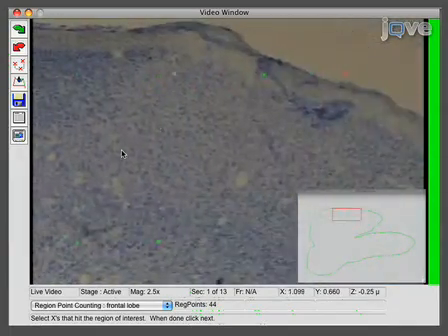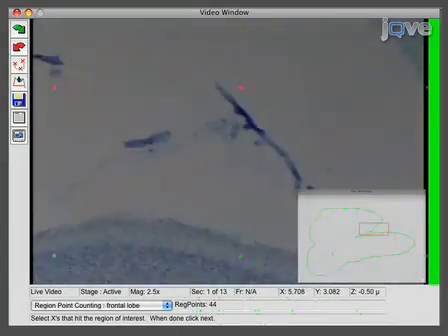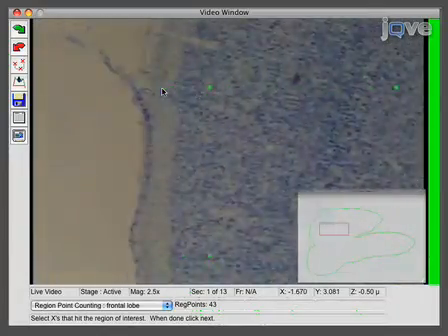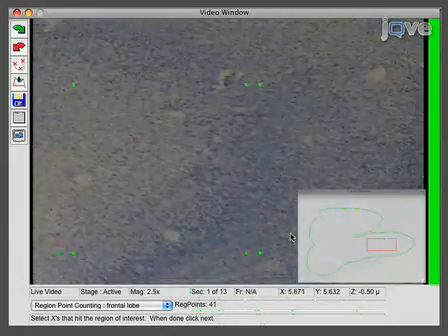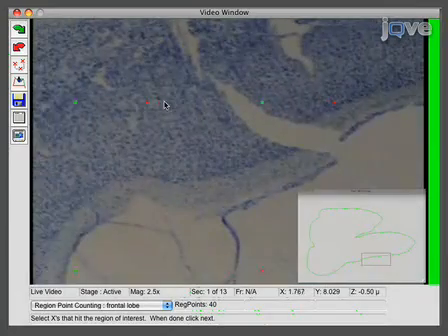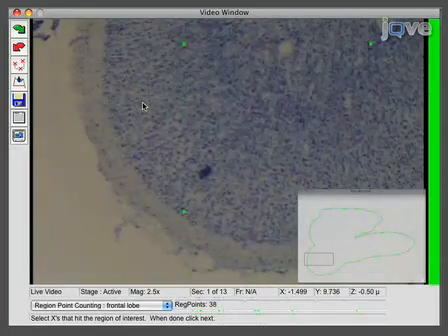Next, the user will verify that the points fall within the reference space. If a point is not within the reference space, simply click on the point and it will not be calculated into the volume. Afterwards, the system will place a new grid over the reference space based on the frame spacing parameters. The intersections on this grid determine where each dissector will be placed.